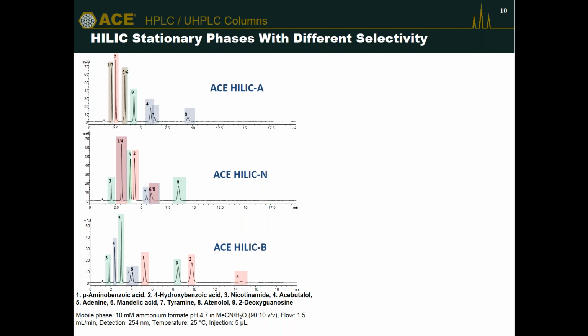And we can see the chromatography is different on each of the phases. In fact, if we pick out, for instance, a neutral analyte, we can see the change in the retention time, particularly on the acidic phase compared to the neutral and basic phase. If we pick an acidic analyte, we can see again the difference between an acidic, neutral, and basic retention for that particular acidic analyte.